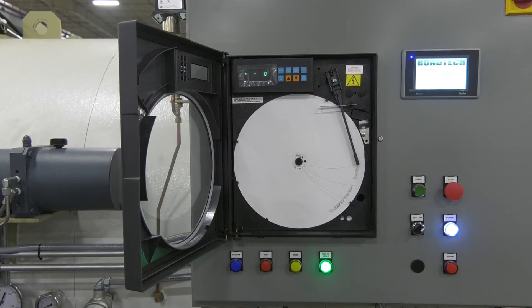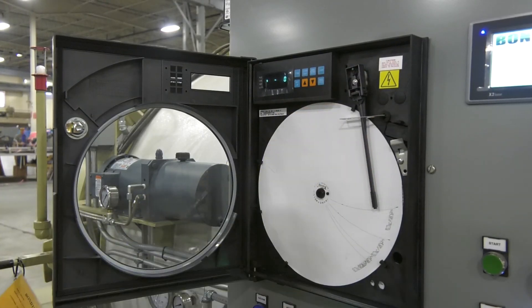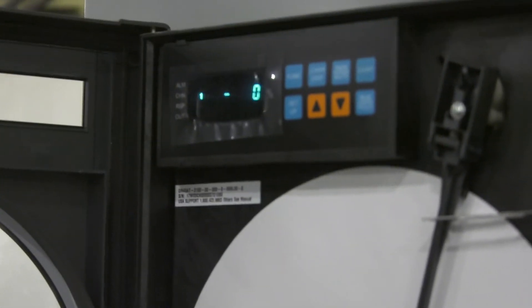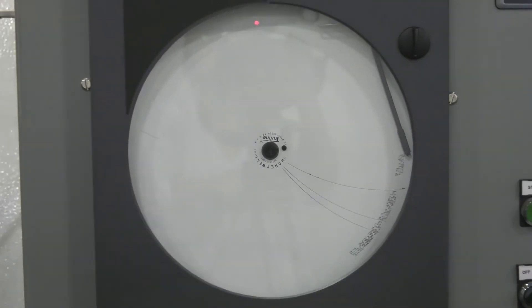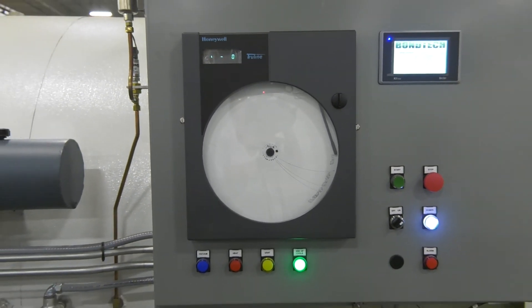The first thing the recorder does is to set the legend for the operating parameters of the chart. Once this has finished, the pen will start registering the variables set up in its program. It is advisable to wait until this registration is done before starting the cycle. The system will run but it will not record the variables until this process is complete.